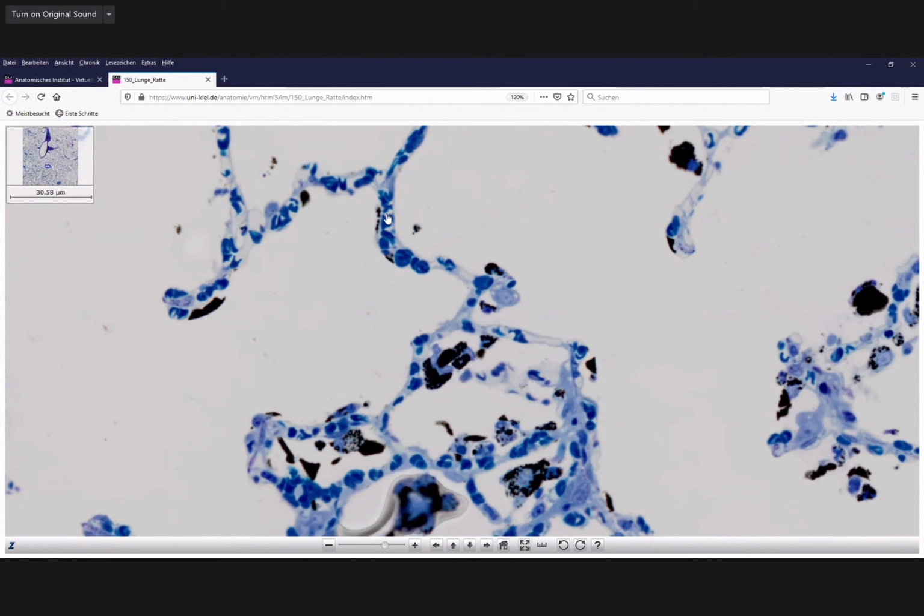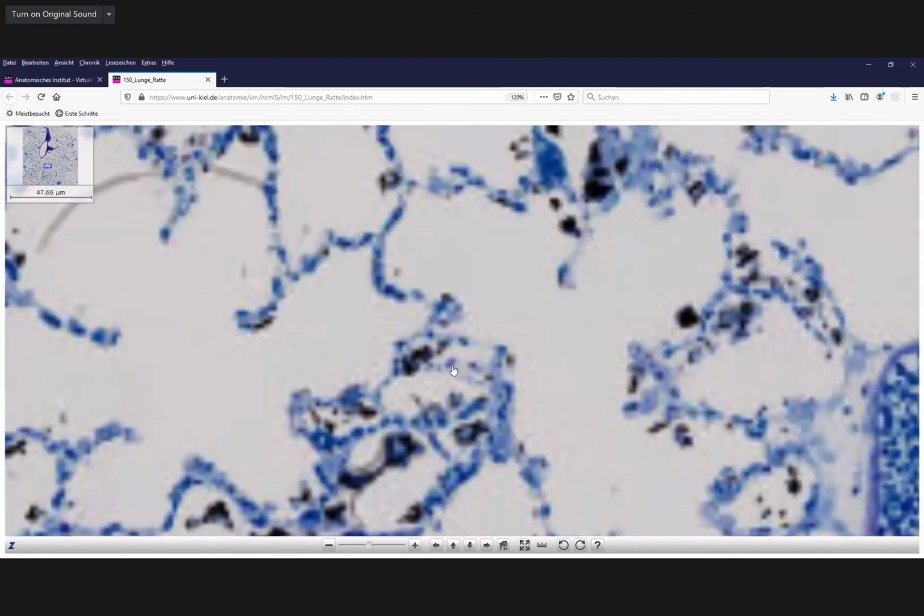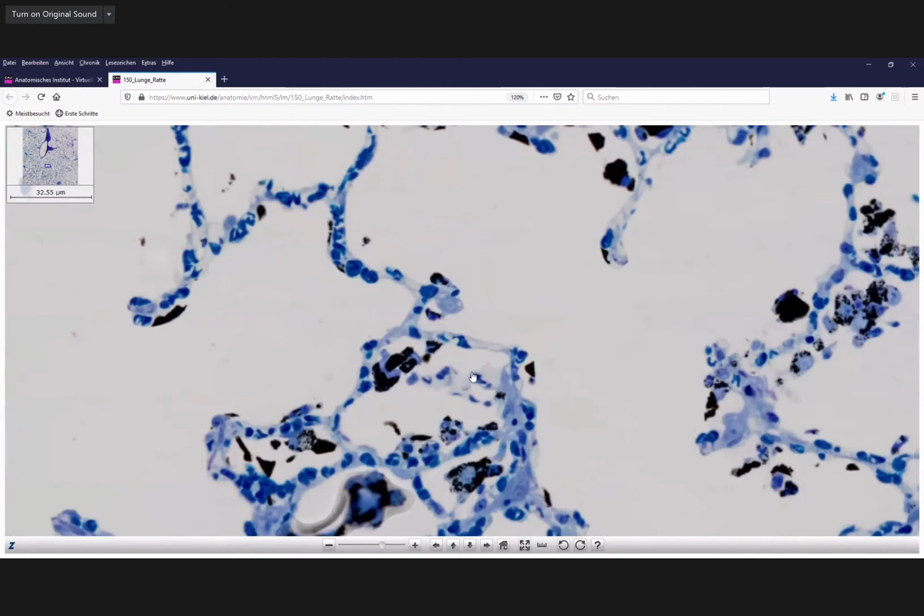Okay, so it's very thin, as you can imagine. When you look at this here, you can see here's the lumen of the blood, the capillary, and then you can see how thin the wall is. And this wall contains all these 4 layers that we were talking about. And here on the other side, the same.